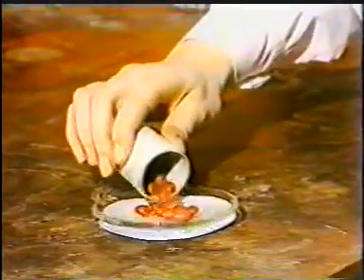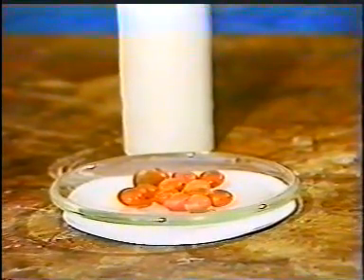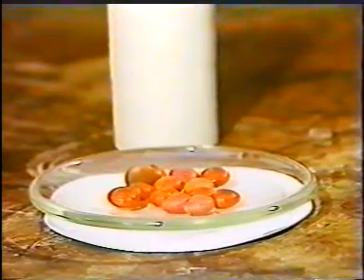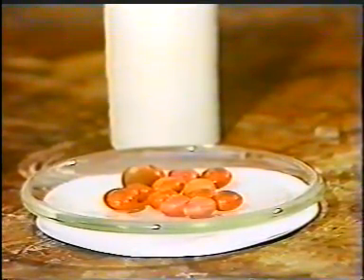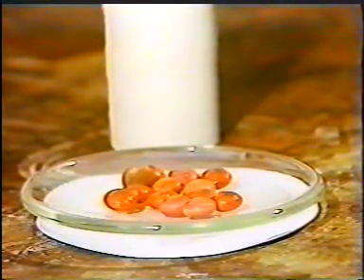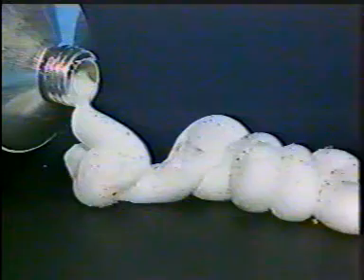You may think that because these products have been subject to the manufacturer's controls, there would be no need to retest. Mistakes do, however, occasionally occur, and sometimes goods are not up to a satisfactory standard. Look at the variety in these tablets, all taken from the same container. And here is a cream which is clearly unfit for use. These faults, of course, are visible, but some may not be.